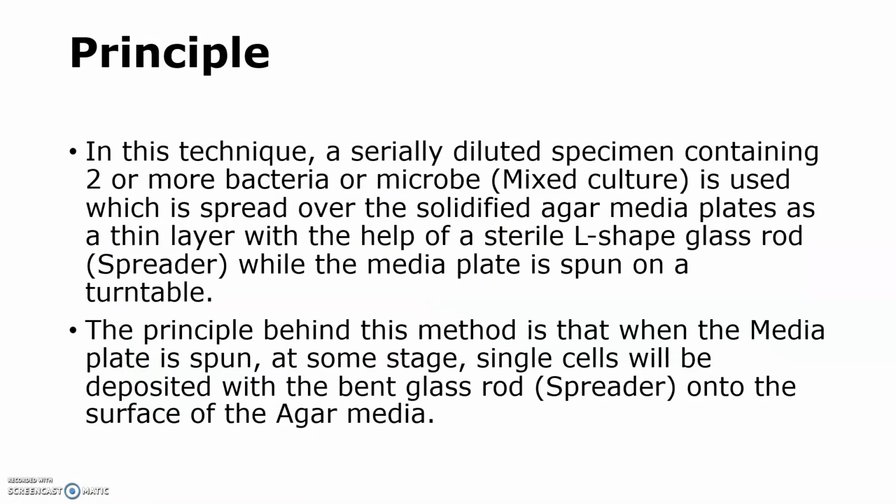Now coming to the principle. In this technique, a serially diluted specimen containing two or more bacteria or microbes, which can be a mixed culture, is used. If the bacteria number is more, then it becomes a mixed culture.